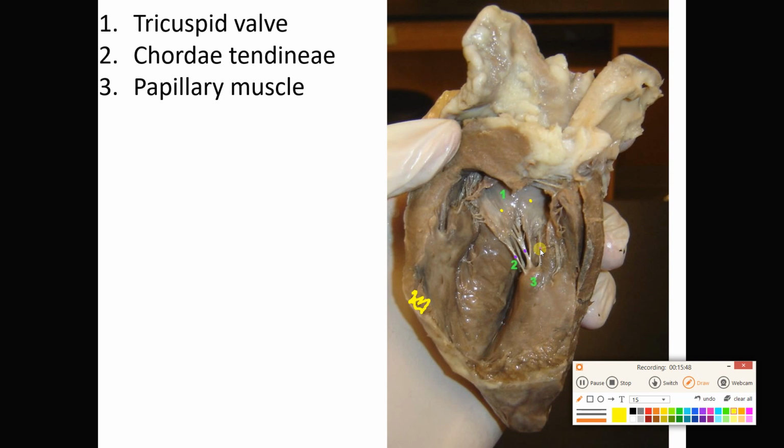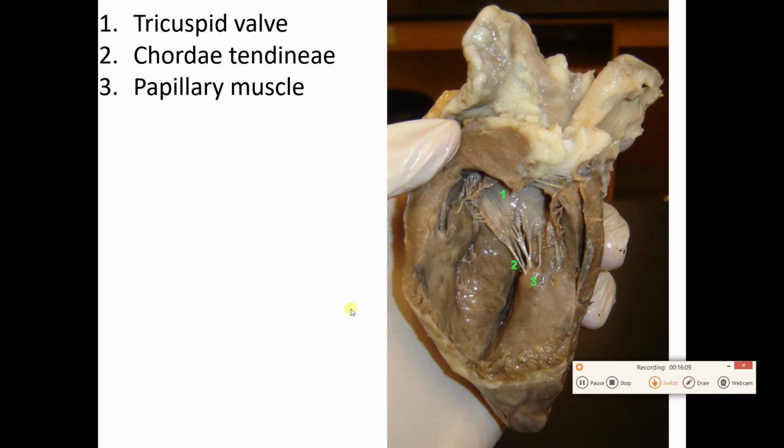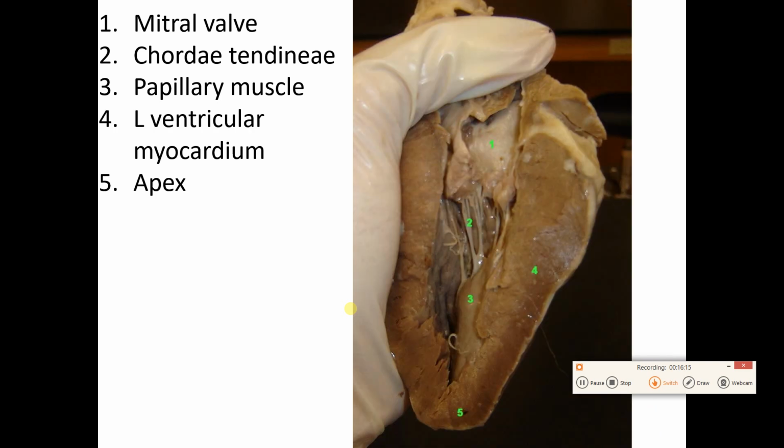Now, if I go down from my ventricle, from my chordae tendineae, I get to this bulge of muscle right there. And that bulge of muscle is a papillary muscle. So I would stick a pin right in that thing and say name the structure. You would say papillary muscle. And you'd get it totally correct. There will be plenty of sheep hearts on your exam. So don't not learn the sheep. That just sounds terrible.